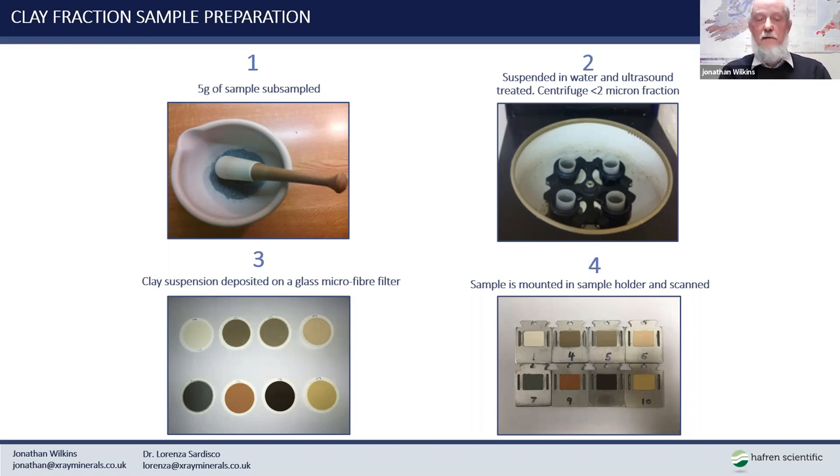Clay minerals also have a particular interesting morphology because they are phyllosilicates. They have a very layered structure and a tendency always to settle rather like leaves in a bucket of water that will pack down into a flattened aggregate.